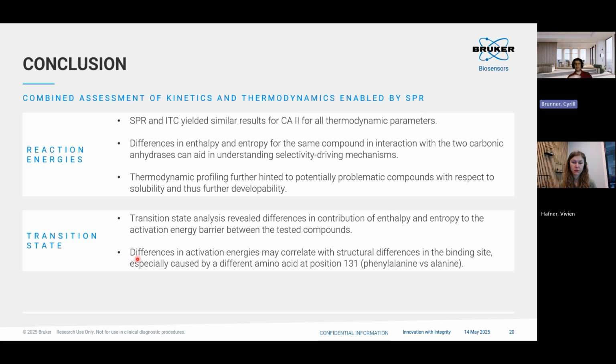So in such an example as we have here, when you were to do first the SPR experiment and got a hint, hey, there might be a difference, that could now trigger the analysis of the crystal structures, or of the actual structural basis of the interaction, and give a better understanding that there might be something different between all of them. If you would just have looked at the KD alone, you actually wouldn't really realize that, and you wouldn't really care.